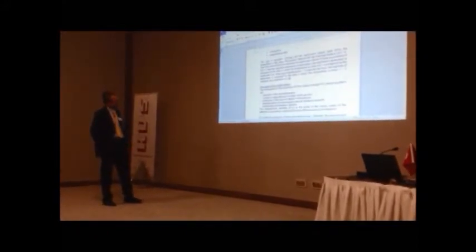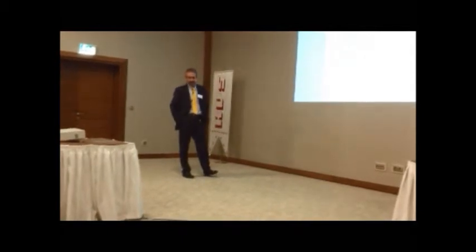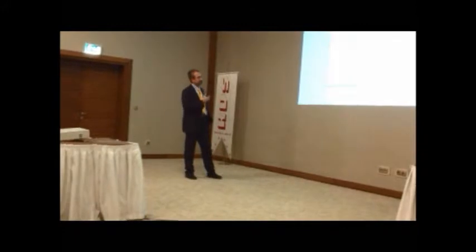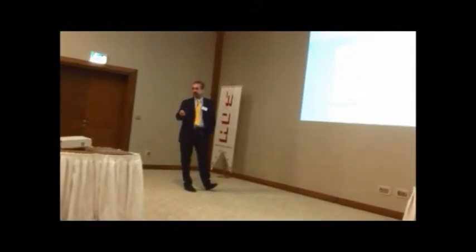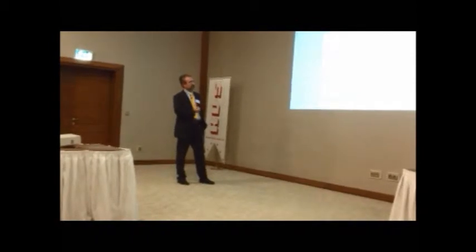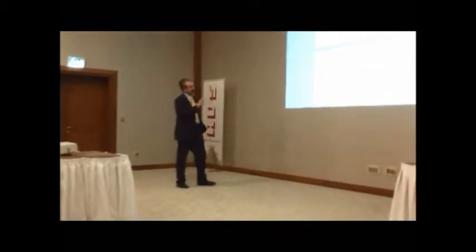Description of the autoclave. It's our Minister of Health who likes this description. It means that we really go into this particular autoclave and we don't use a standard protocol. It's also to demonstrate that we have worked together. Responsibility. This is an important point.